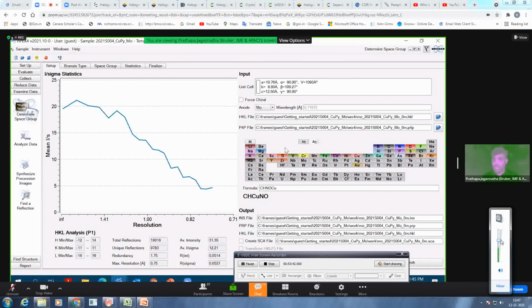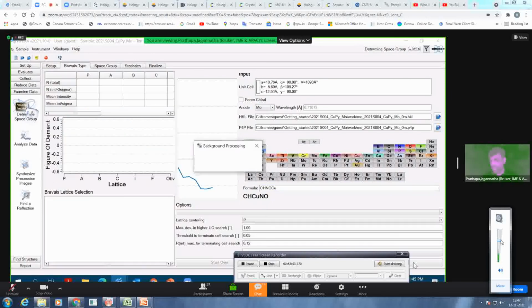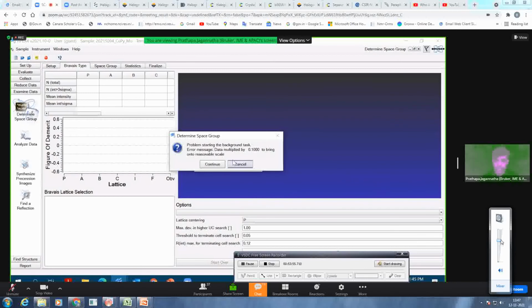You also get this periodic table now, so that you can add elements directly from the periodic table if you have missed something. And then you can click on next, or the finish button is there to make life faster.